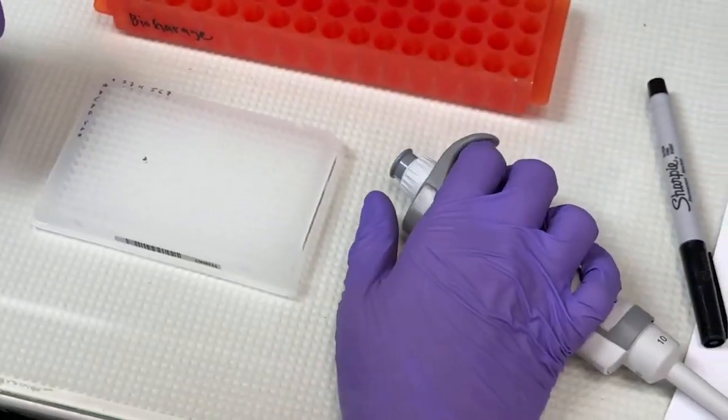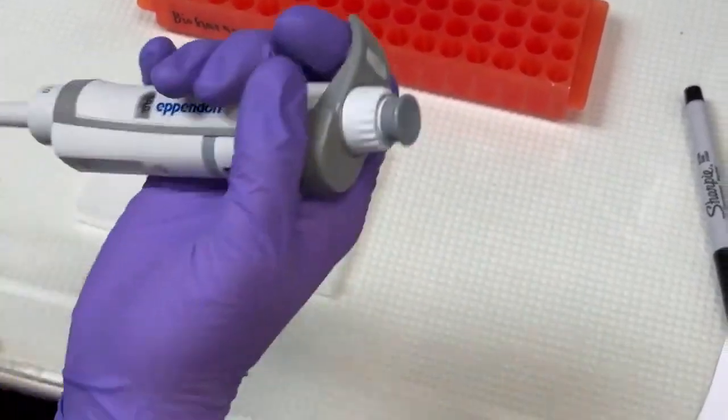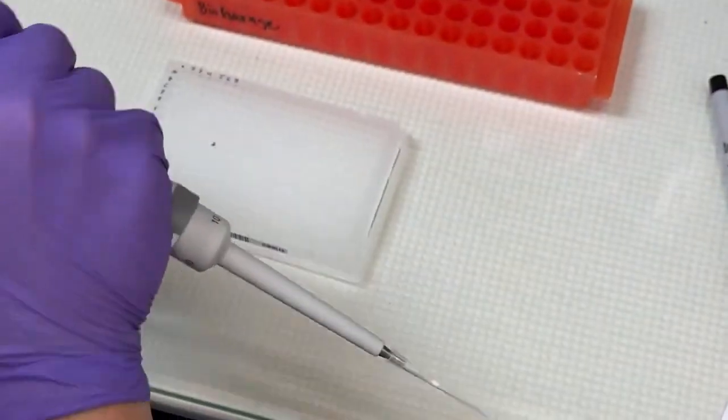When you are pipetting, I don't recommend trying to carry on a conversation with anybody else. It's really hard, and you lose track. So sometimes you just have to say, not right now, friend.